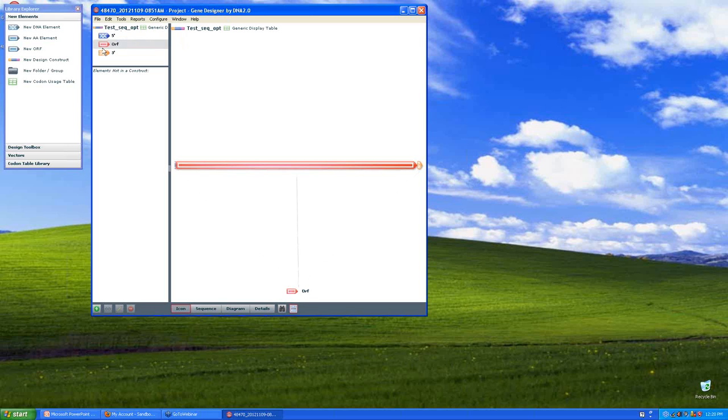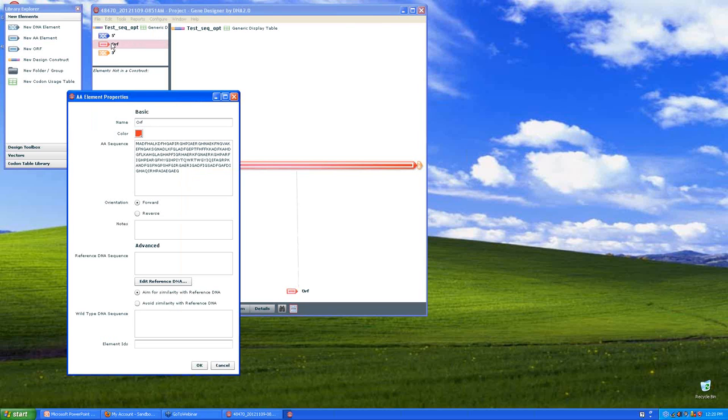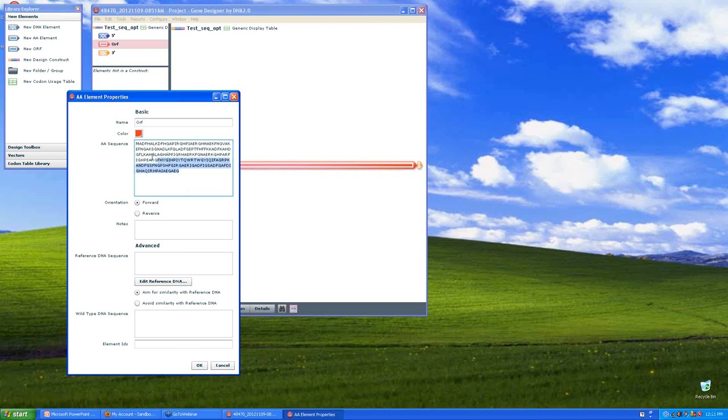And so what I can see from my gene designer file is the construct is made up of three elements. And the middle one called open reading frame or ORF is the coding sequence. And by double clicking on that icon, it brings up the amino acid sequence that is comprised of the codons. So you can copy it straight out of here.